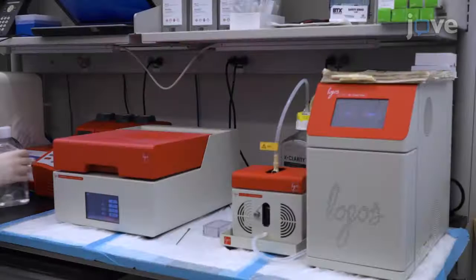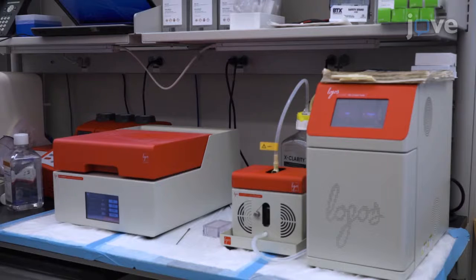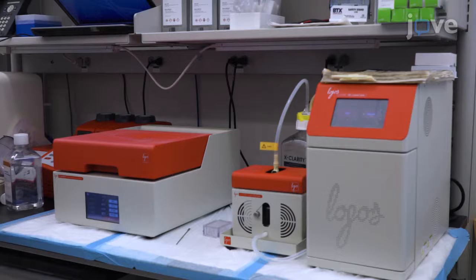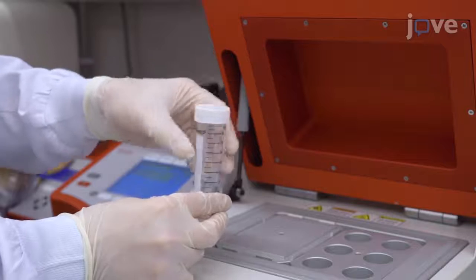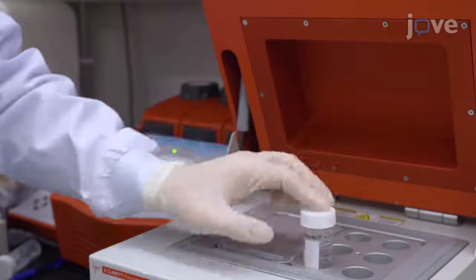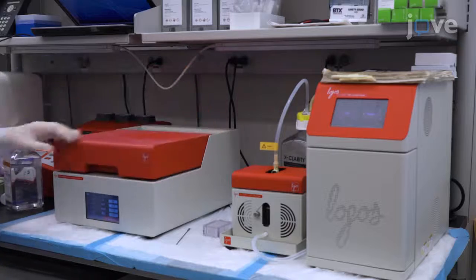To begin, place the hydrogel-submerged brain tissue in a vacuum incubator for three hours at 37 degrees Celsius with a minus 90 kilopascal vacuum. Leave the tube top unscrewed to allow the vacuum to form properly.